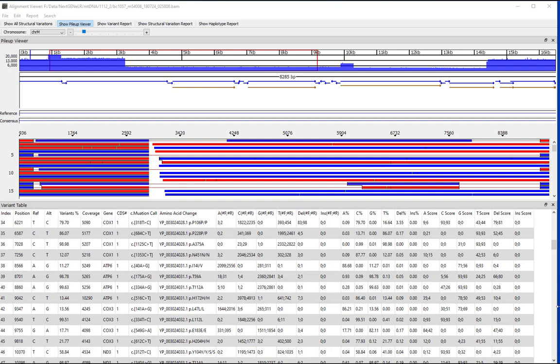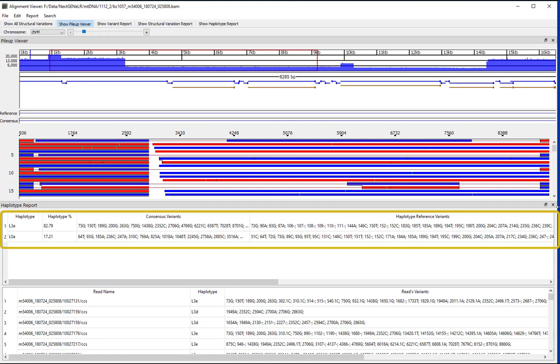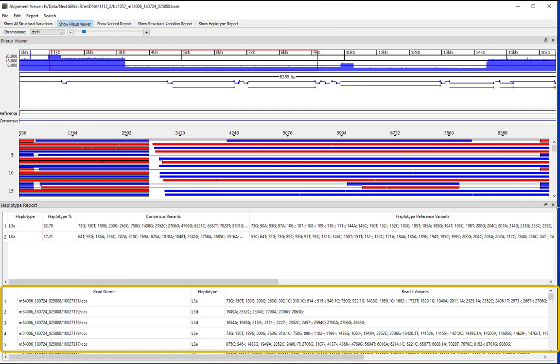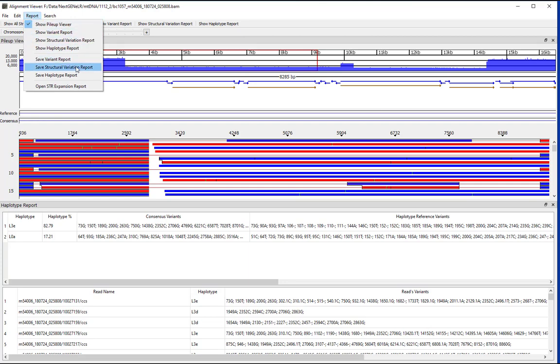The haplotype report is available for chromosome M only. If your data includes chromosome M along with other chromosomes, be sure to first select chromosome M from the chromosome drop-down menu, then click Show Haplotype Report. The haplotype report is broken up into two sections: the top lists the detected haplotypes for the sample, and the bottom lists the haplotype assigned to each read within the sample. For mixtures, haplotypes can be detected at frequencies as low as 0.1%. For each reported haplotype, the haplotype name, frequency of the haplotype, and lists of variants found in the sample consensus and reported in the reference for the haplotype are provided. The haplotype report can be saved by going to Report > Save Haplotype Report.